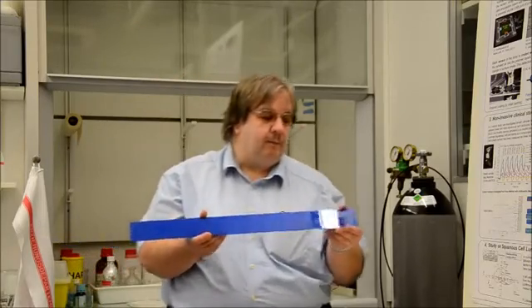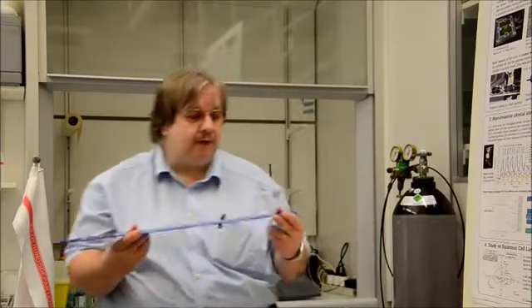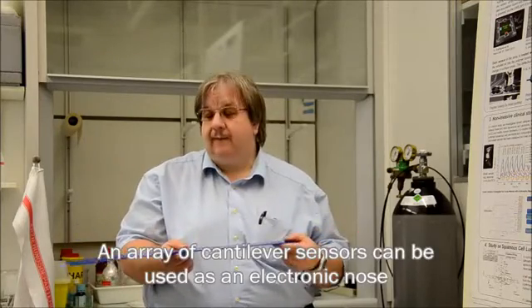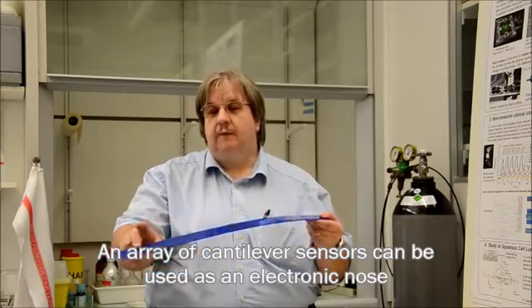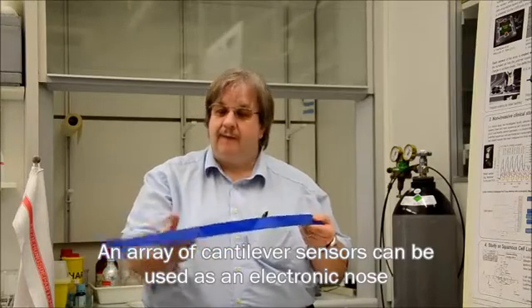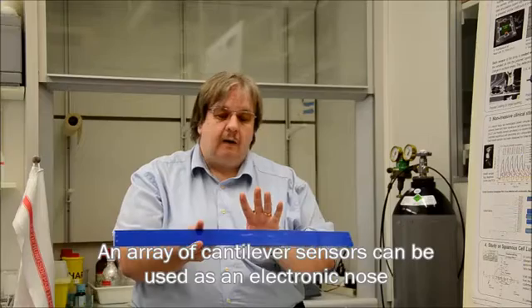We used this idea to produce some kind of electronic nose. But for that purpose we need many of these cantilevers. We need an array of cantilevers, typically eight cantilevers. And we put different polymers onto the surface of these cantilevers. And then observe the response of this array of cantilever sensors. So that was the first application as an electronic nose. And we use that, for example, to detect different solvent molecules.